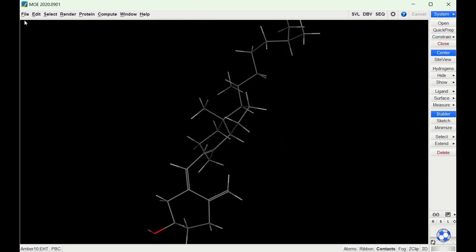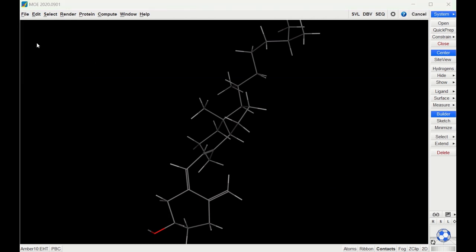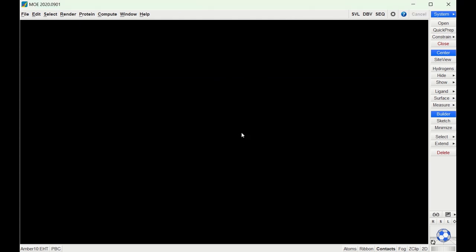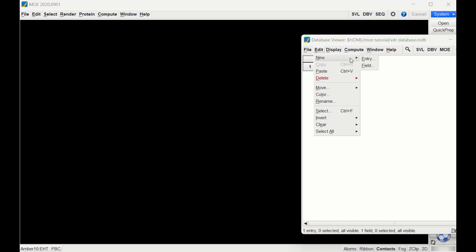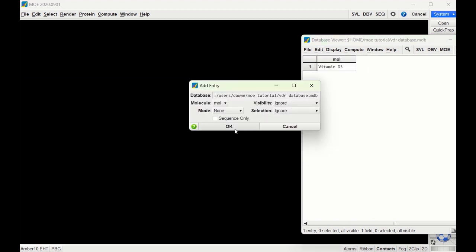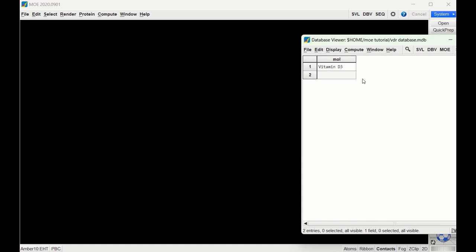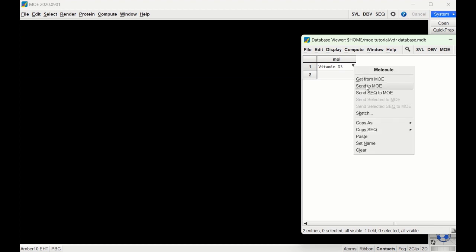So now to draw another structure I'm first going to clear this out. I'm going to go back to the database and click Edit > New Entry. So right now of course there's nothing in it. Let's say we want to draw a structure very similar to vitamin D3 — since we want to draw a similar structure, there's an easier way. We'll first send the structure of vitamin D3 back to MOE.